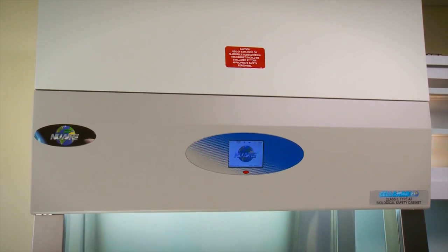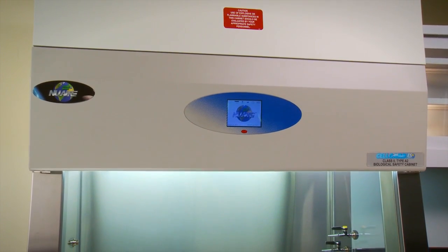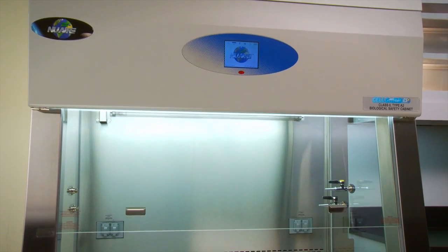Another important part of a safe work environment is making sure it is ergonomically designed to work with you, not against you.